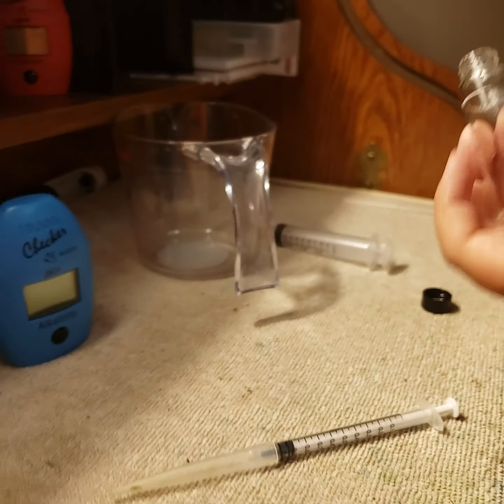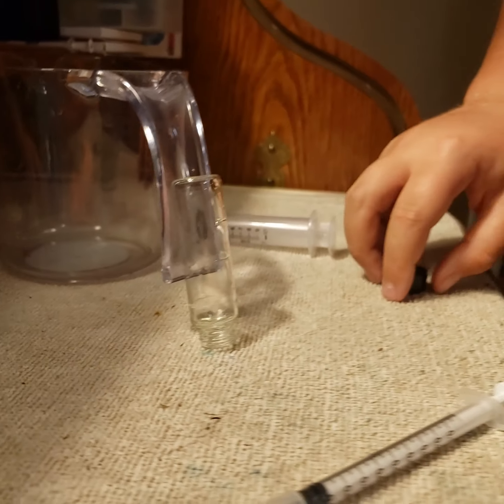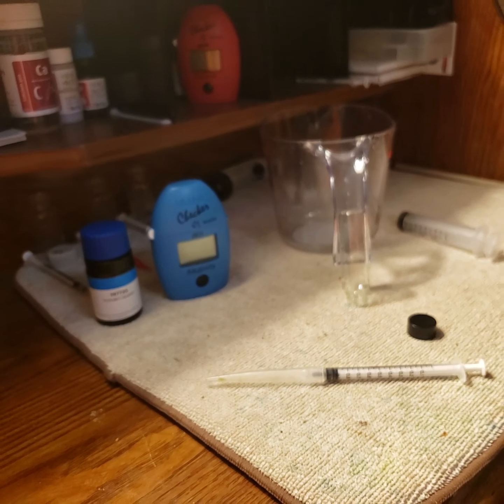Okay, after it's all rinsed, you bring it back here, you tip it upside down and lean it against this cup so that it can dry overnight, and now you've got all your supplies here ready to do it again in the morning.